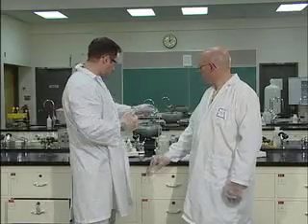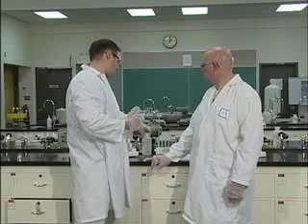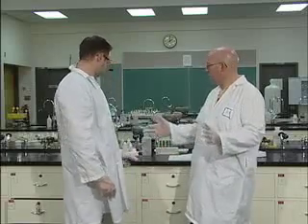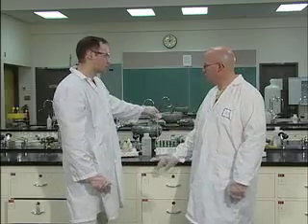And you would note a definite temperature change. And if your litmus paper turns blue, that's okay, too. There'd be a pH change as well. Interesting though, because in the beaker it was just clear. He added the calcium oxide, and it just stayed clear. I couldn't visually see anything. However, we did see a temperature increase, and perhaps a pH change. Is that it for the first one? That's it for part A.